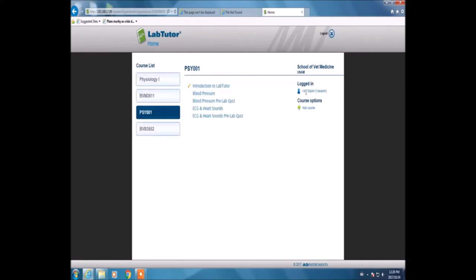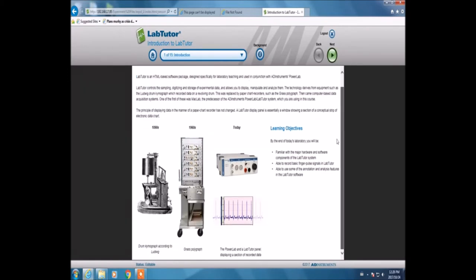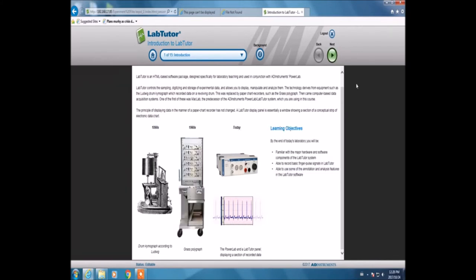I'm selecting Introduction to LabTutor. This is the introduction panel, which shows me advancements made to LabTutor and, more importantly, the advanced learning objectives.